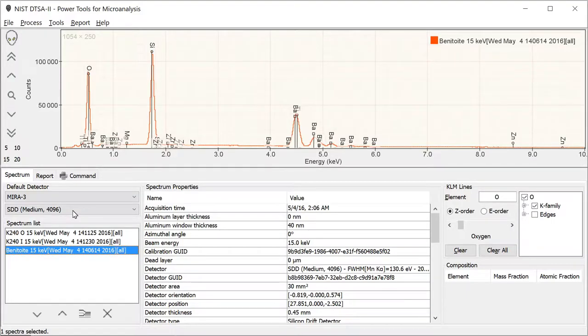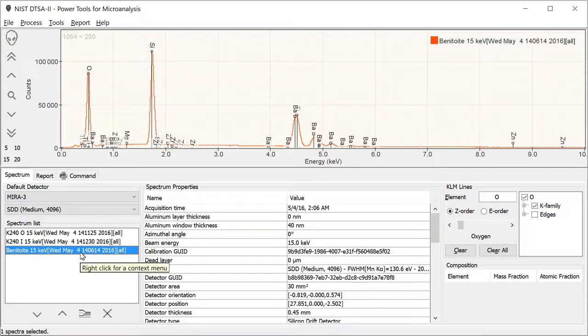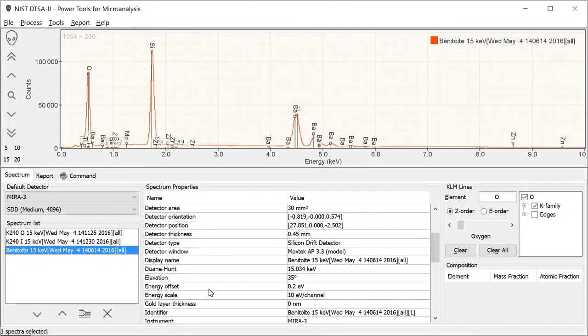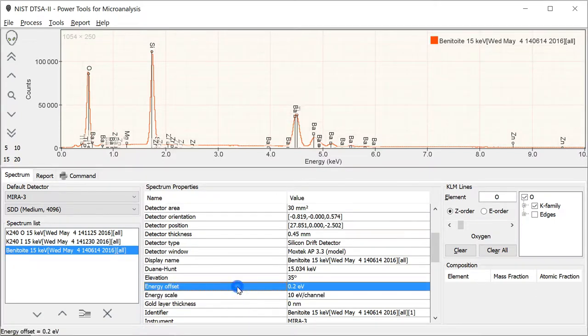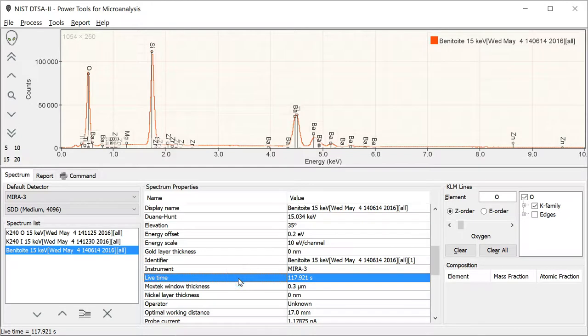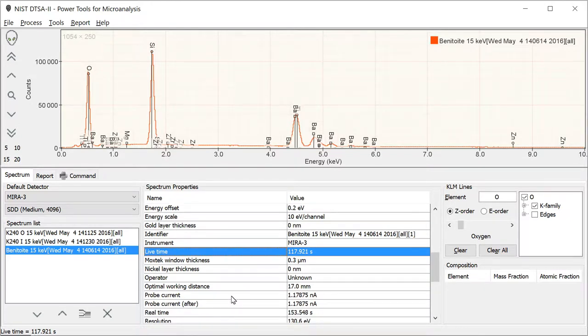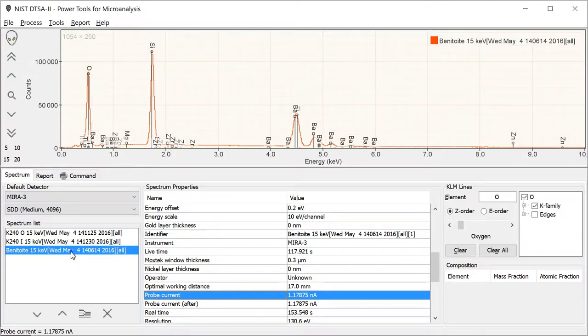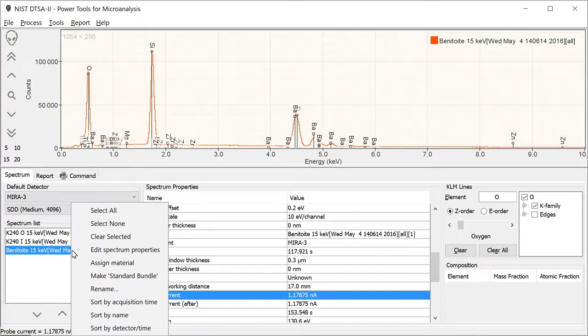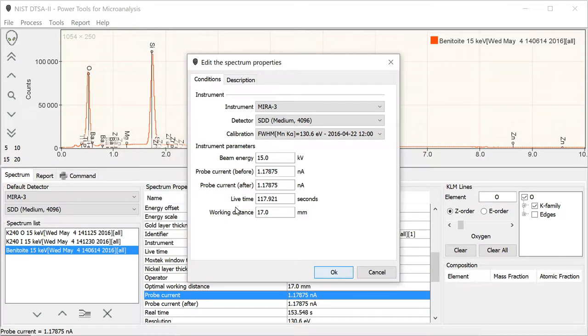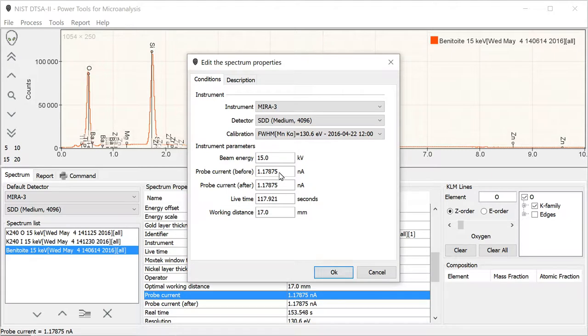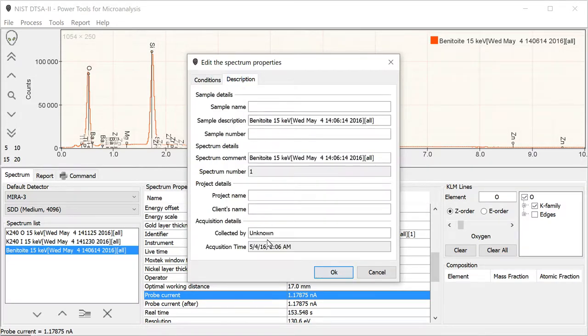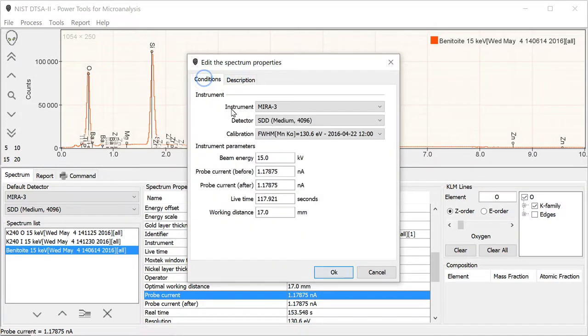Here is one of the spectrum files we're going to use as a standard. If we go through the spectrum properties, many of these properties are the same thing that we could have read out of the file. It's missing certain pieces of information, though. We could just right-click over top of that file and edit the spectrum properties. You can see that it would allow us to update or add various pieces of information. You can specify the probe current that was measured before the spectrum was acquired, a second probe current measured after, live time, beam energy, working distance. You can also provide various different pieces of contextual information.